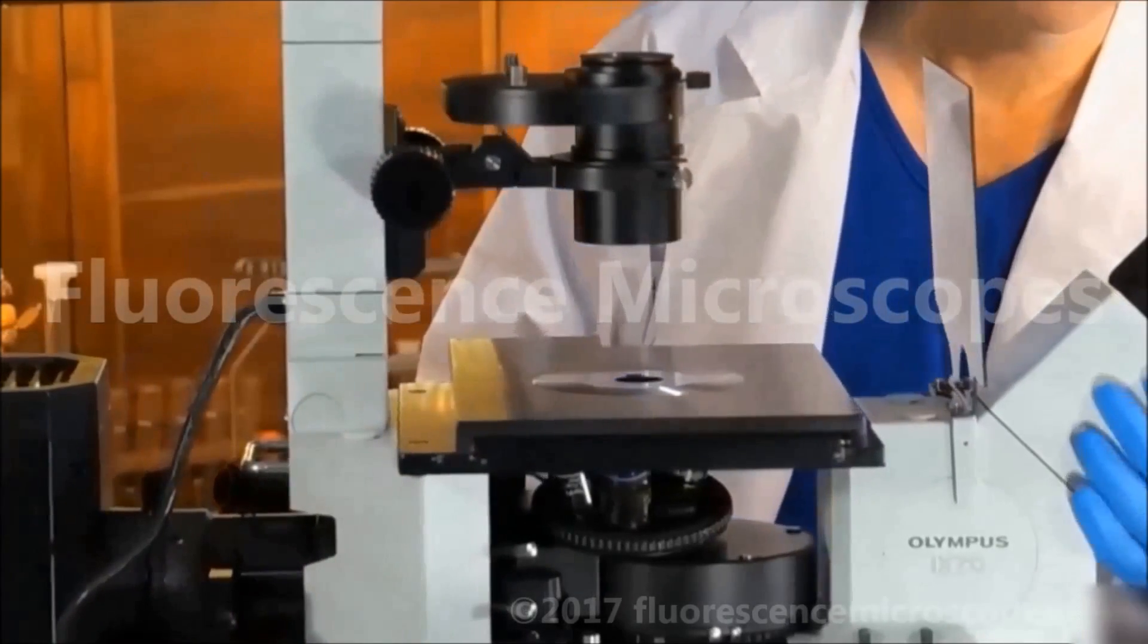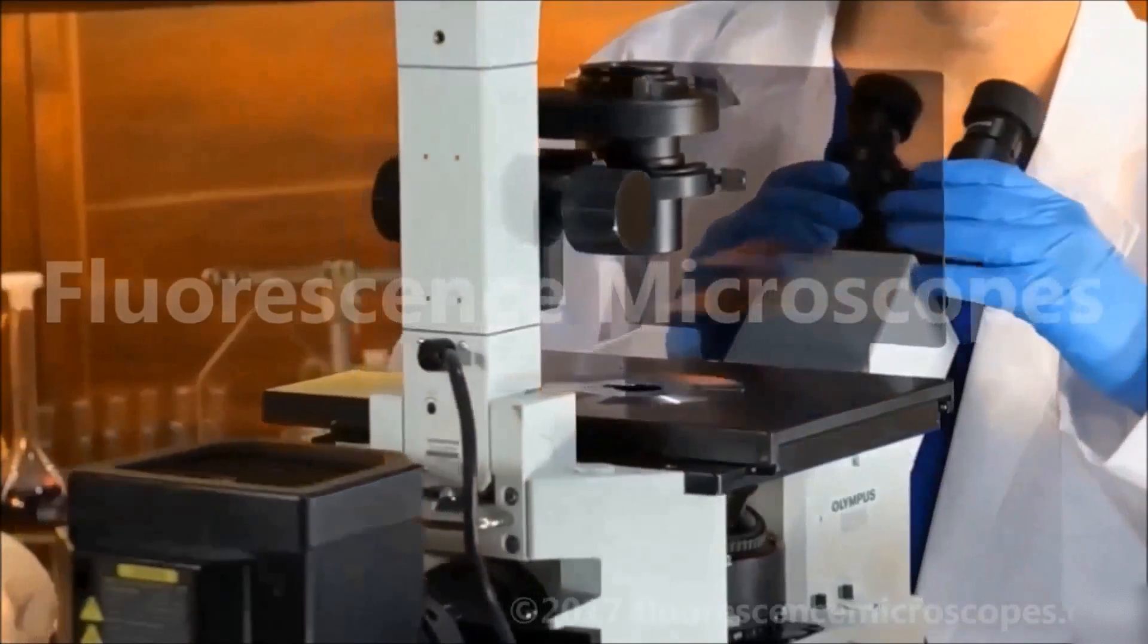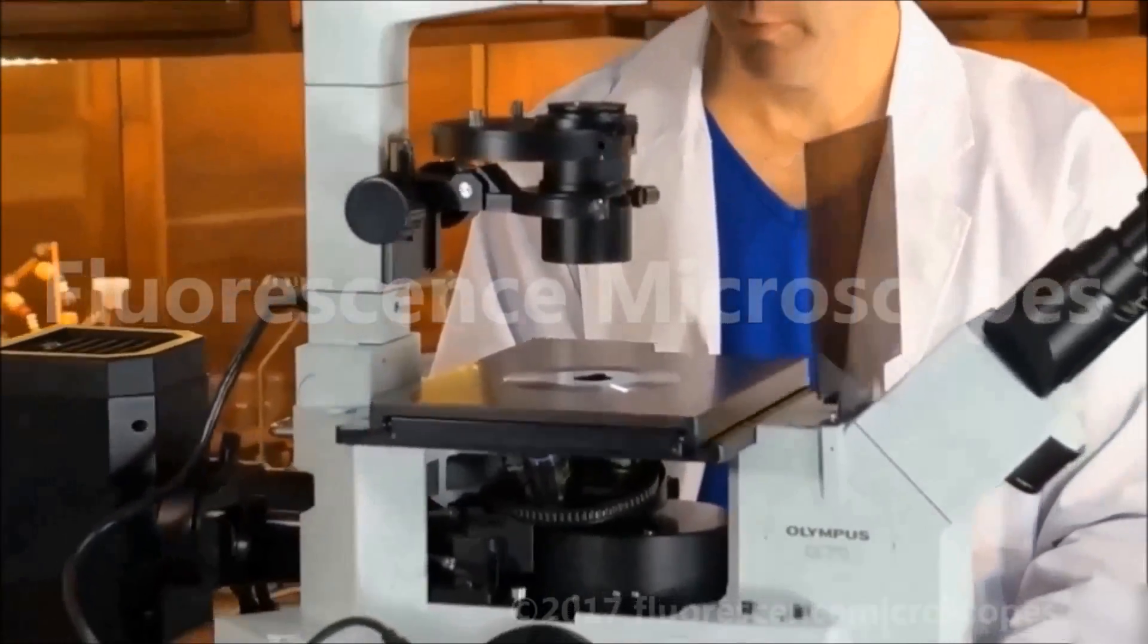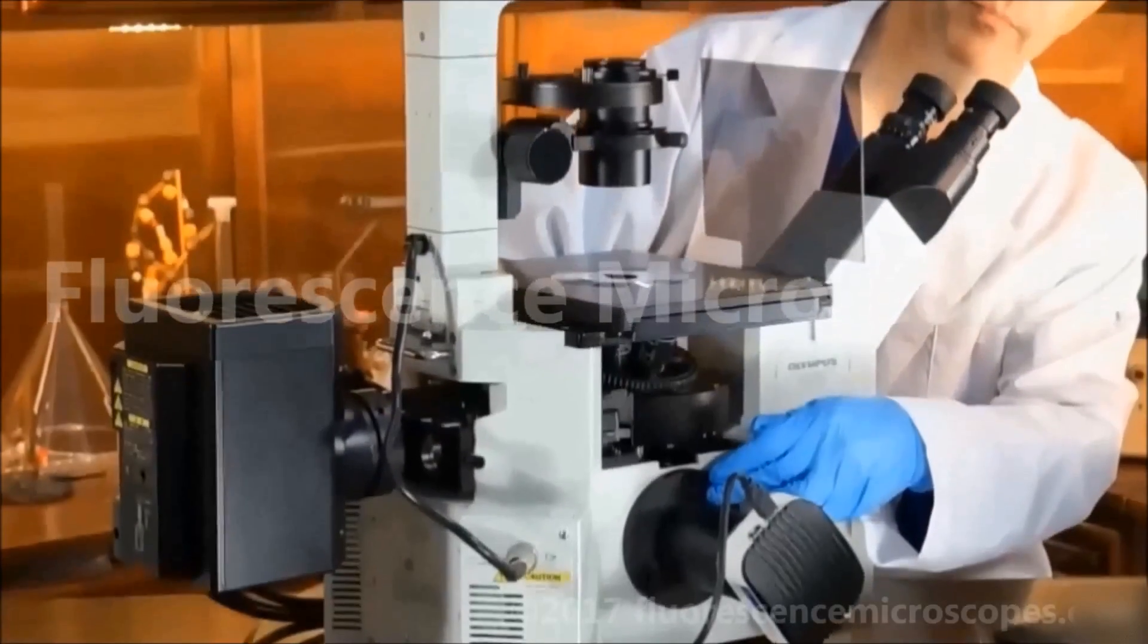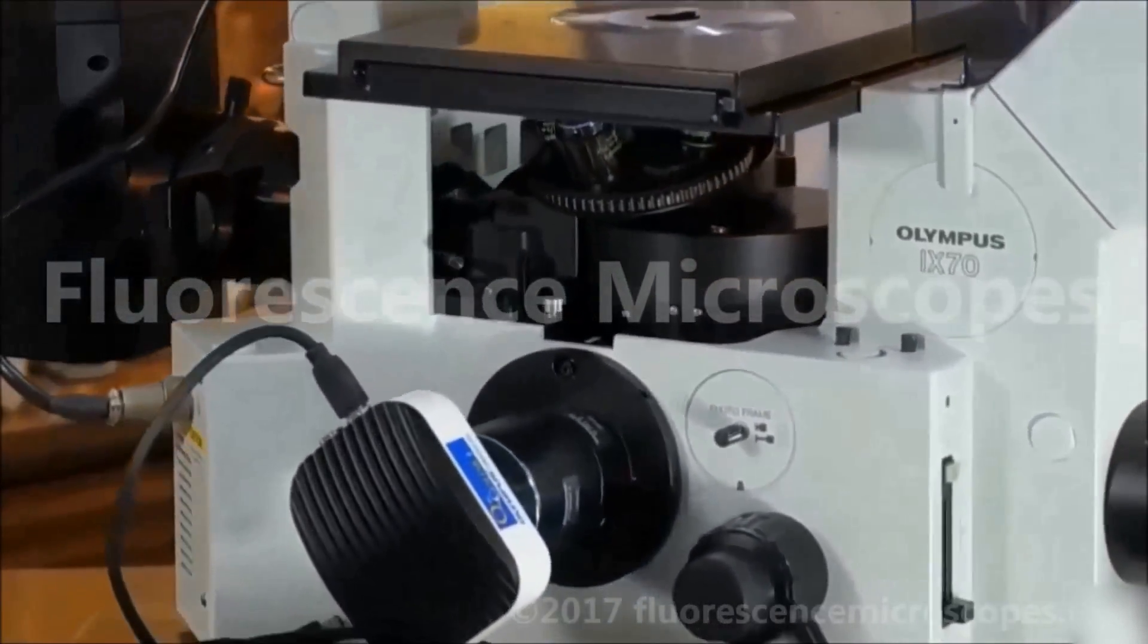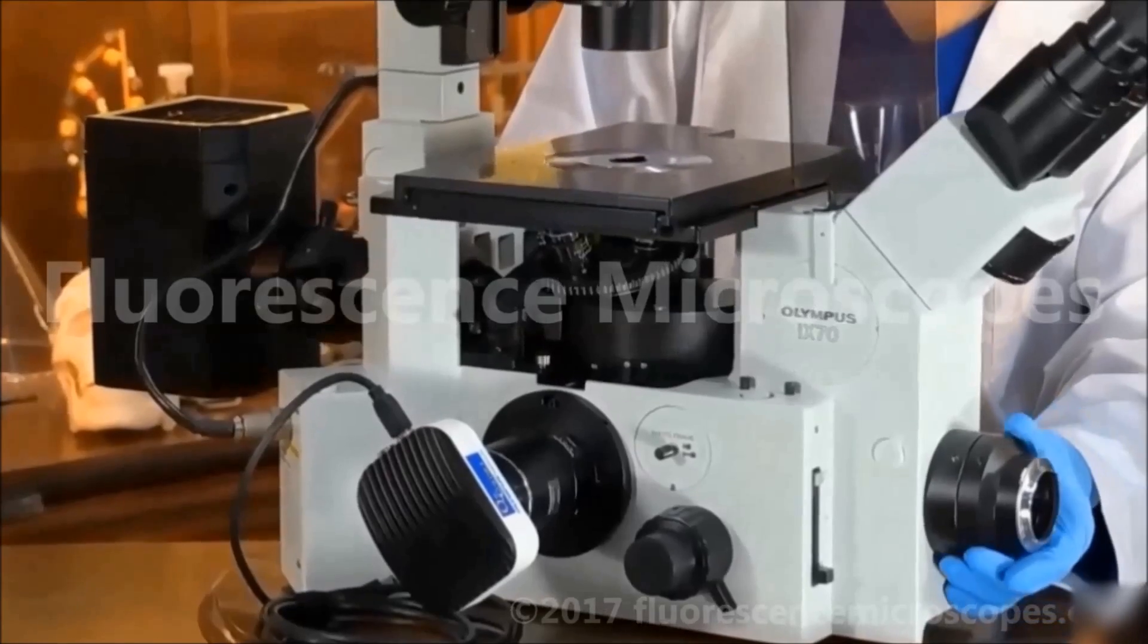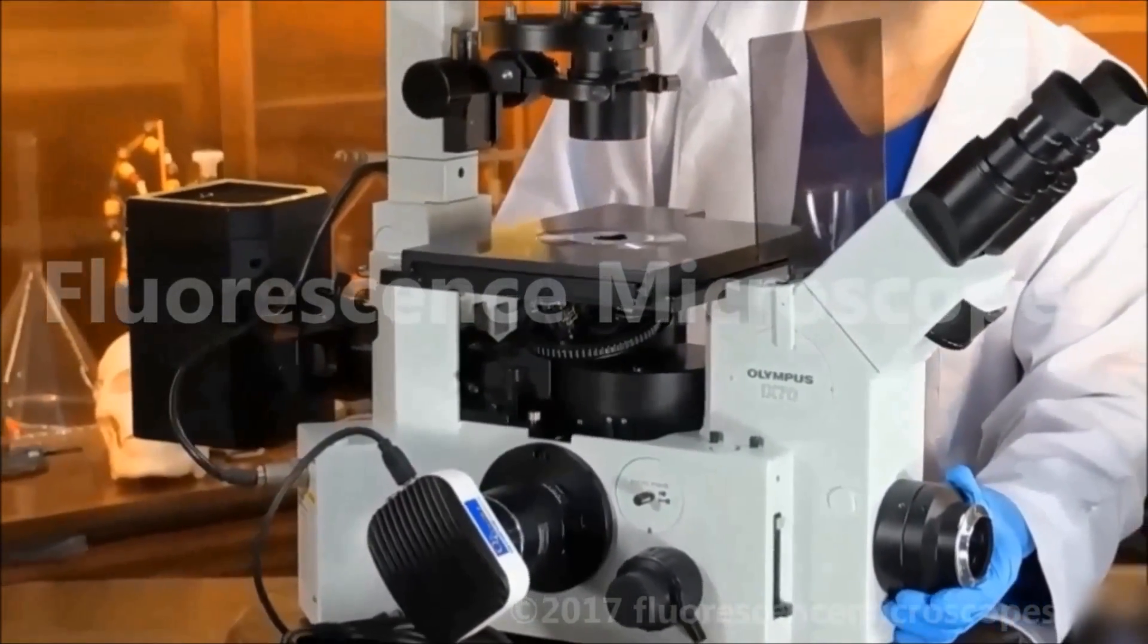This has a binocular hand, a binocular viewing tube, and we also have two different photo ports. One photo port is on the side, and the front photo port is for an SLR camera, like a DSLR, such as Canon EOS Rebel, would be an example.